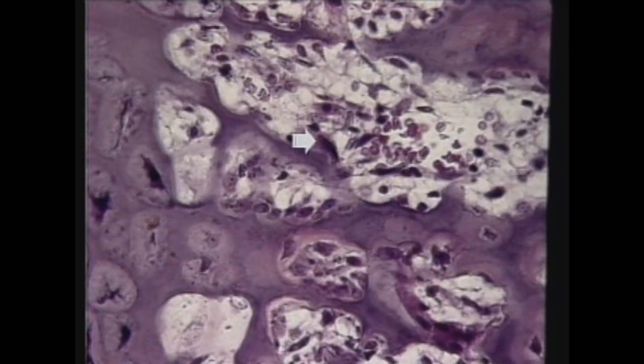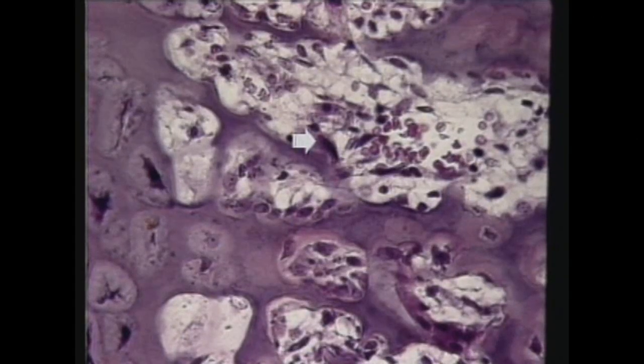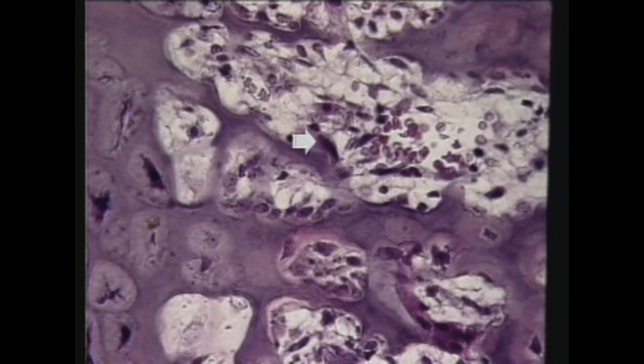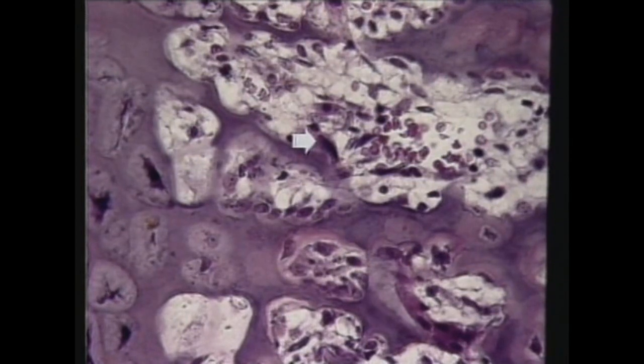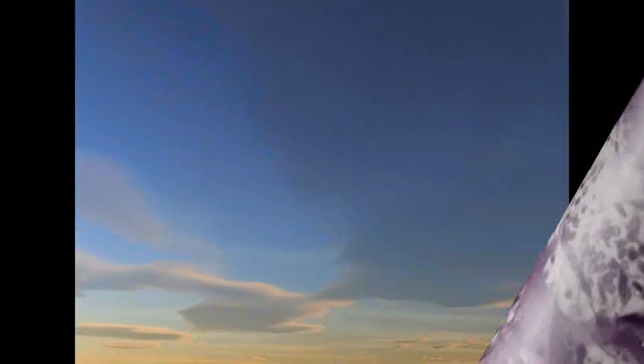And the last question, number ten. What kind of cell is the arrow pointing to here? If you said osteoclast or chondroclast, you are right. The arrow is pointing to a large multinucleate eosinophilic phagocytic cell that eats its way through cartilage or bone. Well, if you got 100% on the exam, congratulations — it shows you're learning histology. We'll see you.